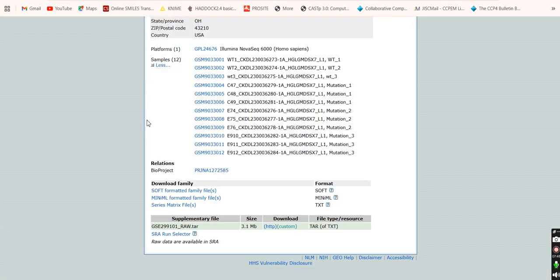Thank you guys for listening. To summarize, if you want miRNA data or small RNA data or lncRNA data, just look for total RNA sequencing data with rRNA depletion. We are not looking for ribosomal RNAs. That is the reason we are mentioning rRNA depletion. That will also give us the best data.